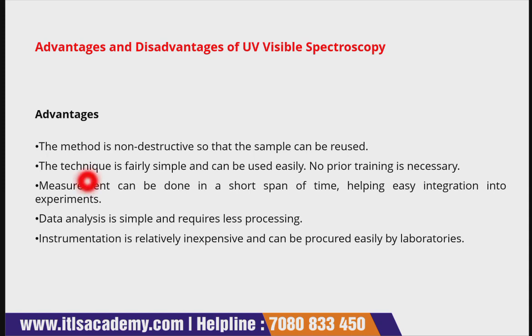This technique is fairly simple and can be used easily. No prior training is necessary, so it is saving your money. Because this is very simple and you do not require any training before handling this technique, the measurement can be done in a short span of time. Since this technique takes very little time, the measurement can be done very easily and in a very short period.